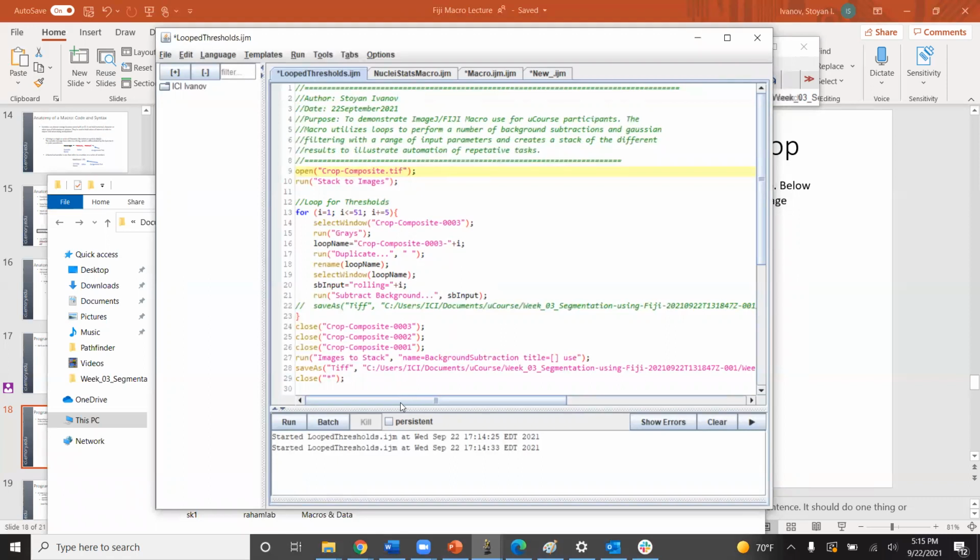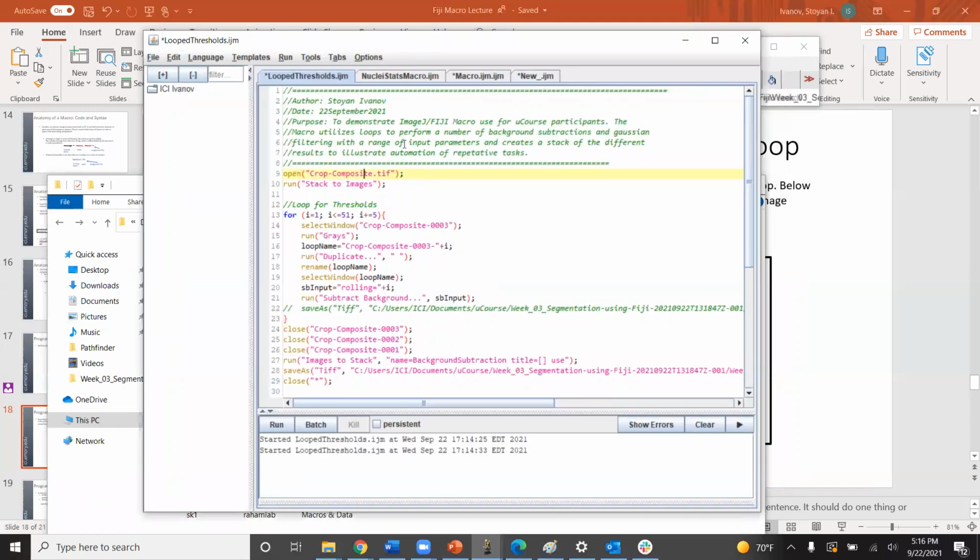So Stoyan, if I want to end up getting a dialog box over there which says, as soon as you run the code, if I want to specify open, the dialog box comes out and tells me to open a particular folder, right? How do I do that? Because I think that will be much easier, so that it doesn't matter where your macro is, you can tell where the file location is. Yeah.